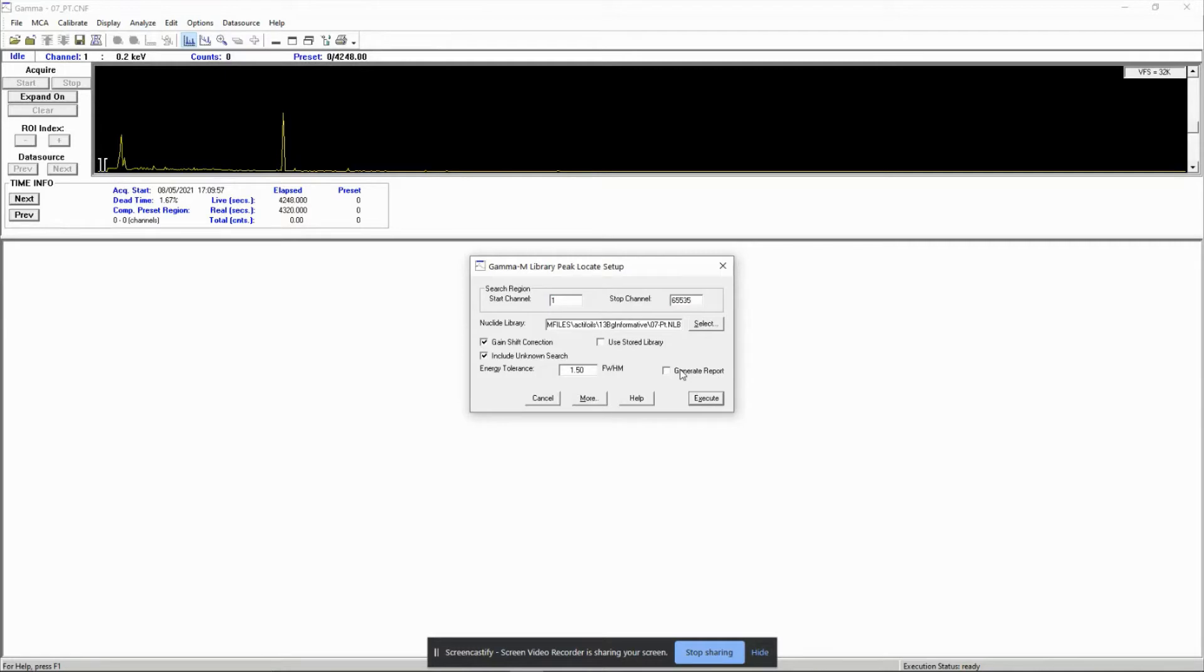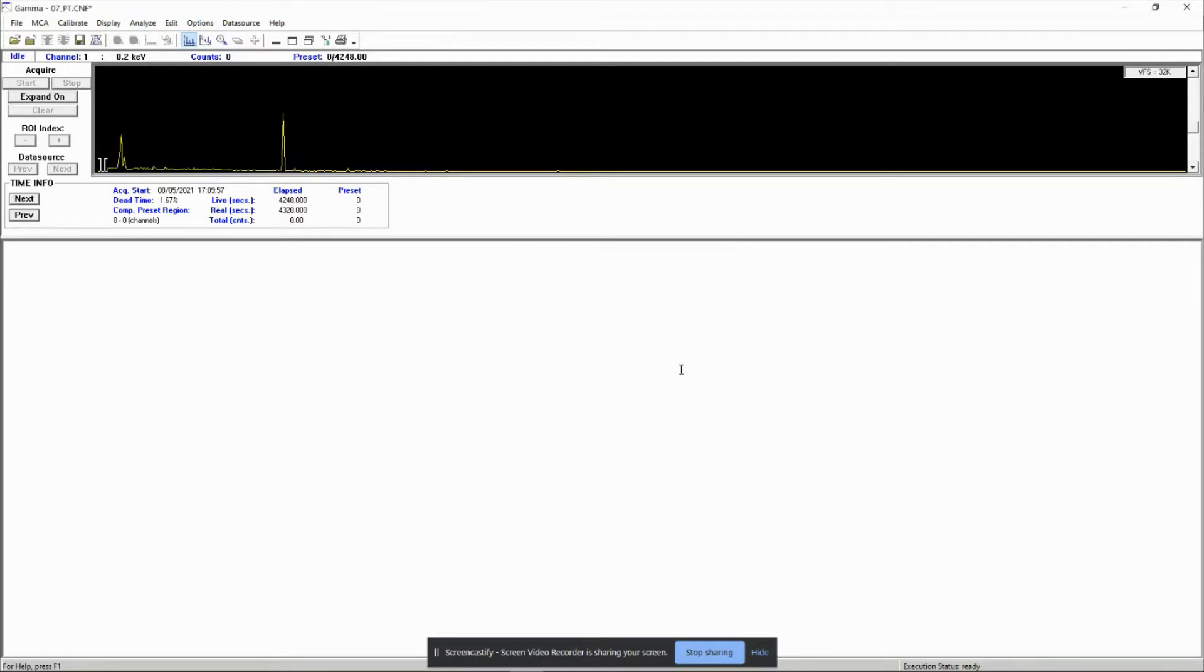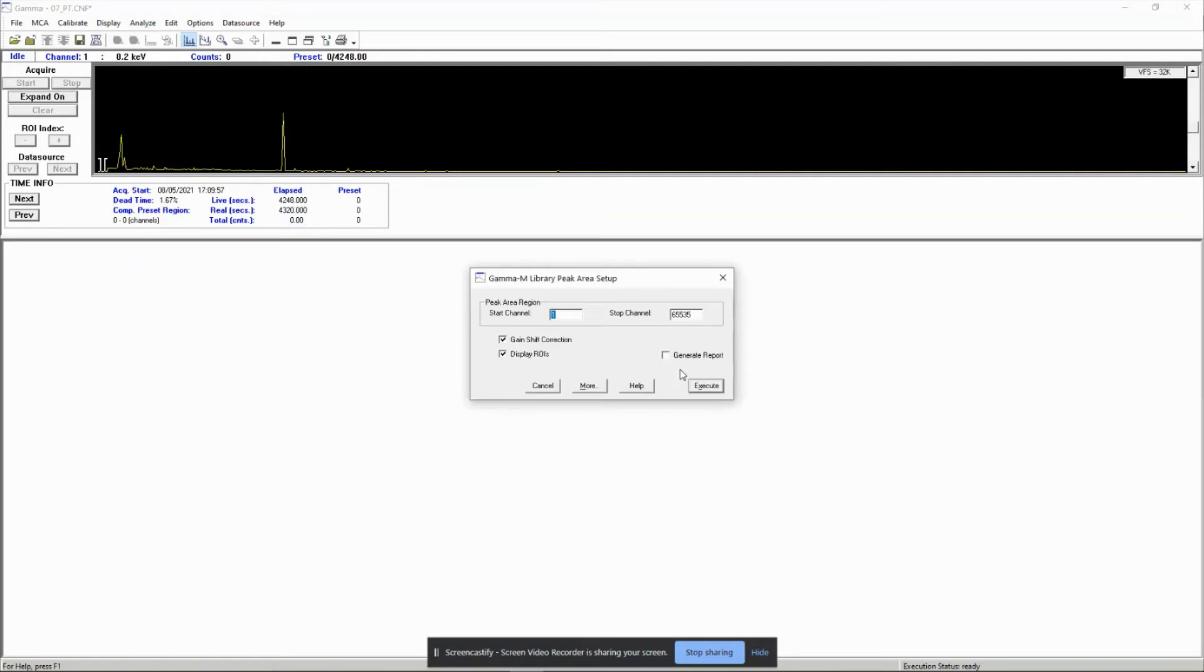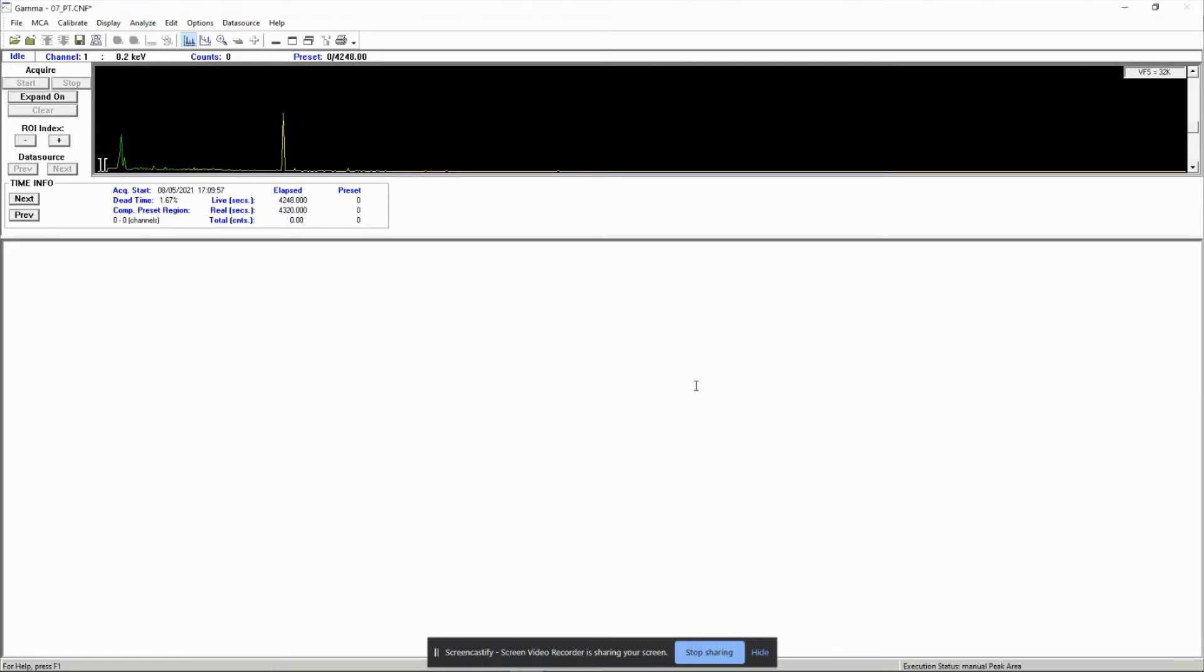Step one: peak locate library gamma m. Enter the library you've created. Step two: peak area, library gamma m.